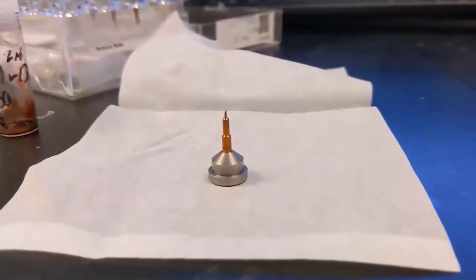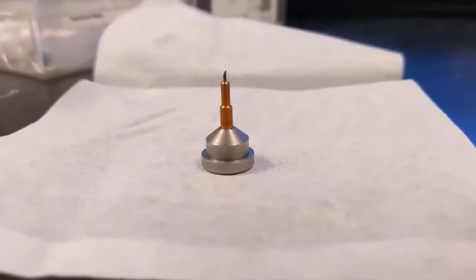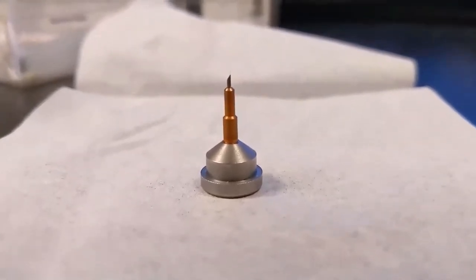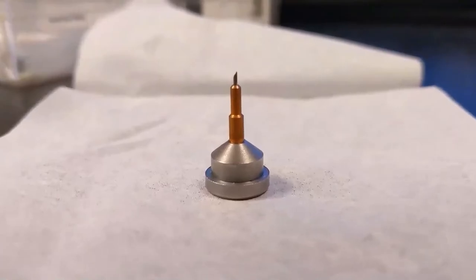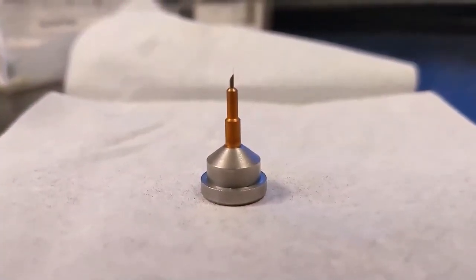This is the type of mount used by groups at GU. The silver part is a magnetic base that allows for easy mounting on the goniometer. The copper shaft securely grips the interchangeable micromount tips. If you look very closely, you can see the extremely thin polyimide loop coming out of the top. We'll get a closer look under the microscope soon.